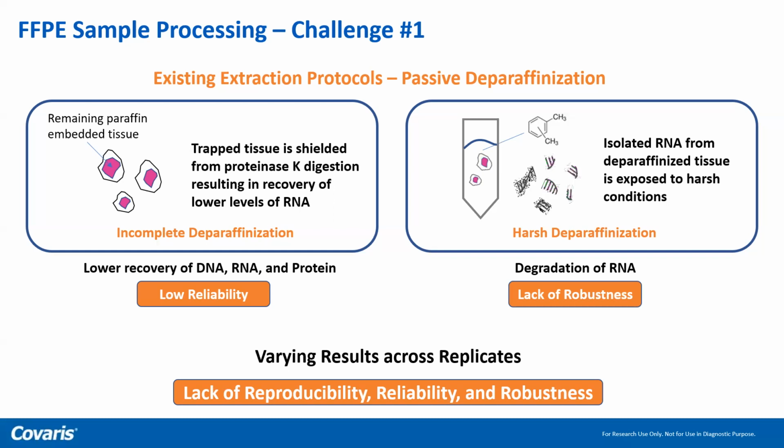And genomics people will say DNA, RNA. Everybody's right. But one thing that is common across all of them, no matter what they're doing, is what? It's the quality of sample. You have to have good quality of samples in order to, as probably all of you are aware of the term or phrase, junk in equals junk out. So you need to have good quality sample coming in to get good quality data.